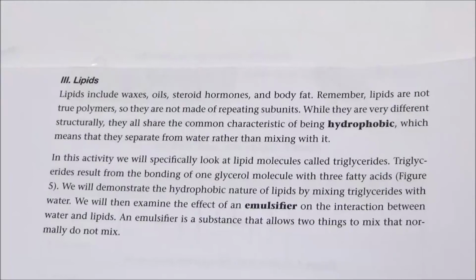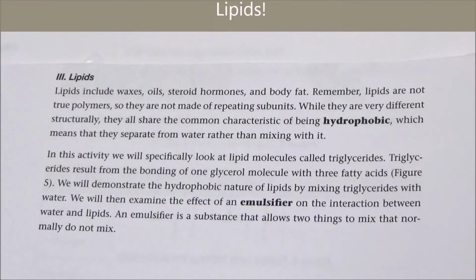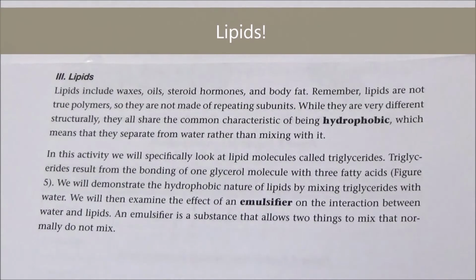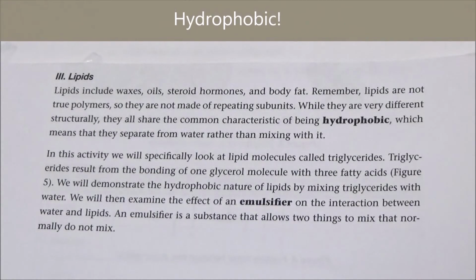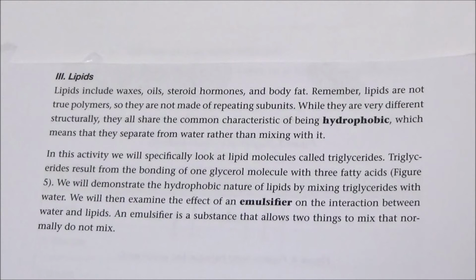Now let's take a look at the section on lipids, part 3, which begins at the bottom of page 42. Now we're not really going to test for the presence of lipids. We're just going to explore one of the main characteristics of lipids. So lipids are a very diverse group of molecules. But the thing that all lipids have in common is that they are hydrophobic, which means they separate from water rather than mixing with it. Hydrophobic literally means fear of water. So lipids behave like they're afraid of water.